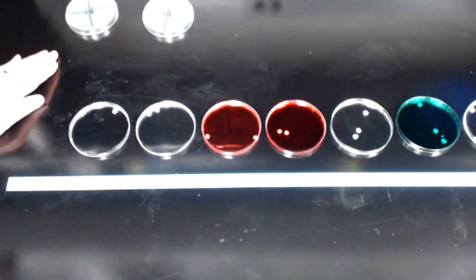The zone of inhibition is simply an area adjacent to the disc where there is no growth. The larger the diameter of that zone of inhibition, the more effective the disinfectant antiseptic is against that particular organism. The smaller the diameter of the zone of inhibition, the less effective a particular disinfectant antiseptic is against that particular bacterium.